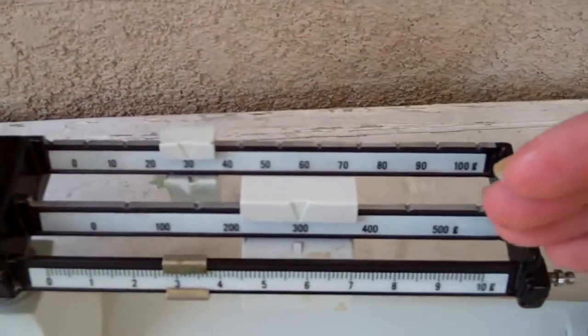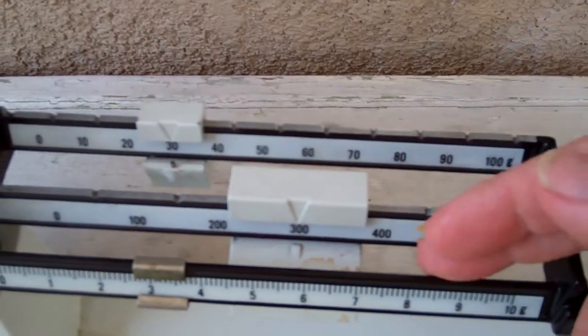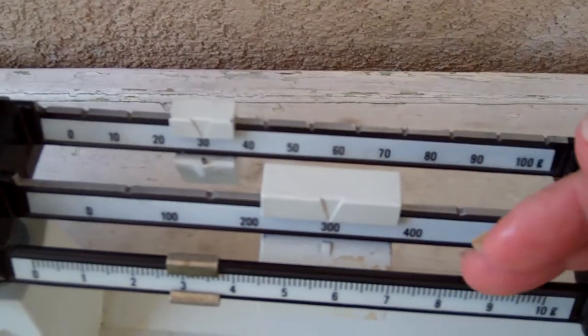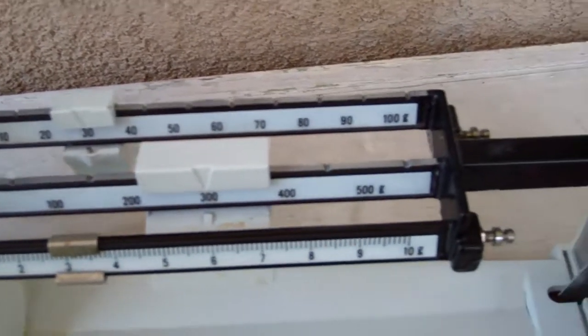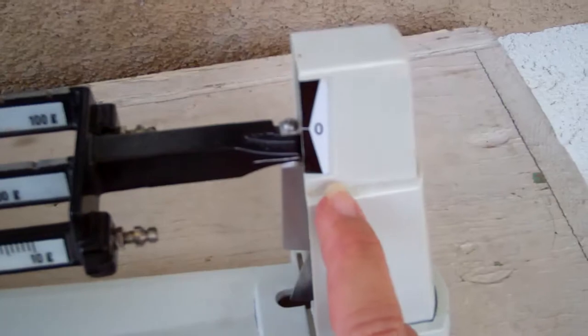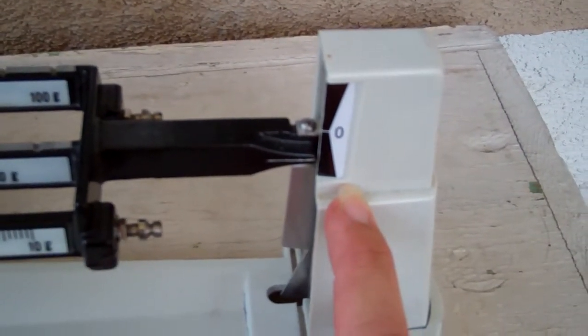label the adjustment knob right there. Make sure you have three beams, one, two, three, notice they have numbers on them. Those are important. And the zero line. Those are the things you need to remember to use a triple beam balance.